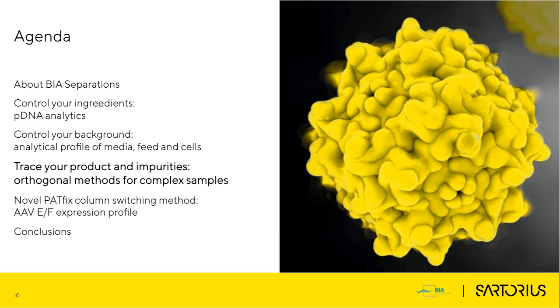So the next topic we're going to discuss is about tracing of your desired product as well as impurities. If you have been in the AAV field for a longer time, you are probably familiar with these requirements of the regulatory bodies of reducing the percent of your empty AAVs as low as possible. So there is an obvious trend of this requirement increasing. So in future, we are probably going to see less and less empty AAV being allowed for gene therapy tools. So it is, of course, our desire to remove as many empties as possible.